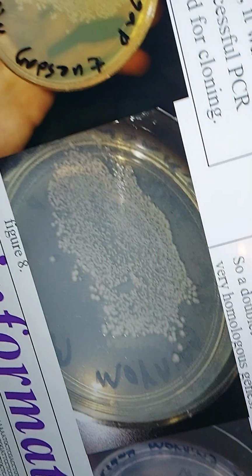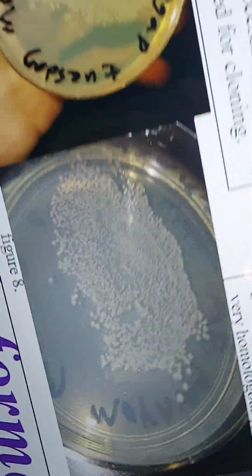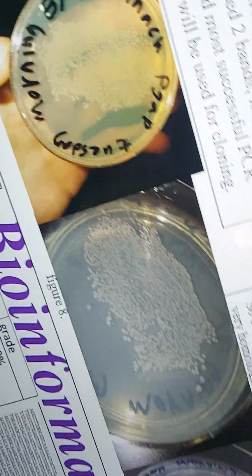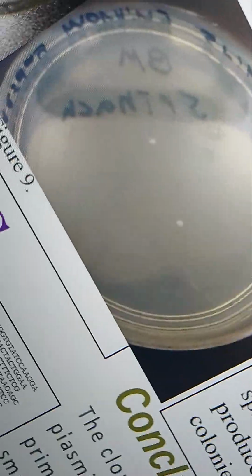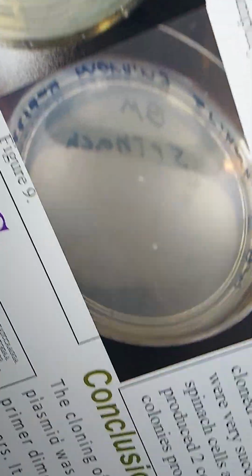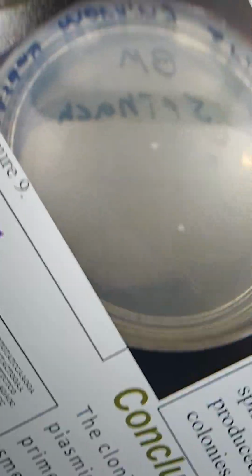But the P-gap, the spinach P-gap, actually did produce a tremendous amount of colonies, and the P-gap was very successful. Keep in mind the P-gap is the control. So this is actually the one that we cloned. And although it's not as successful as the P-gap, it still worked. And since it did work, it was enough to be gene sequenced later on.